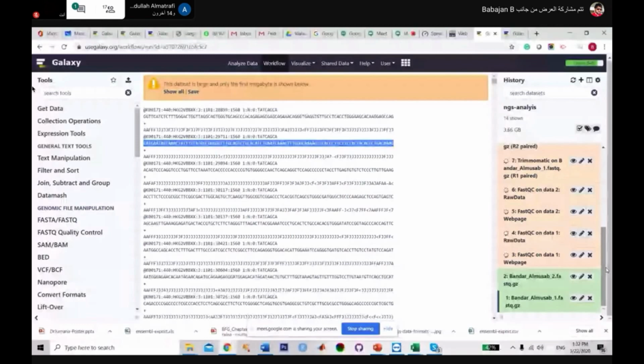We can do so many things here in a Galaxy platform. Even with the local host, if you are able to install Galaxy on your computer, as I installed it on my laptop in Linux, you can add so many softwares there. Here in the online platform we have very limited software installed. If you install it offline, there are many tools developed for the local host, where you can install all the software inside your local host.